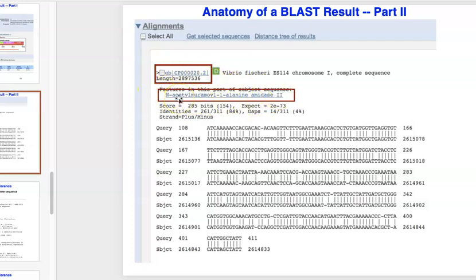And it also suggests that you may have some sequencing errors that cause these problems, unless this is from a different organism, in which case these could be real, and your sequence just diverged from the Vibrio fischeri sequence.